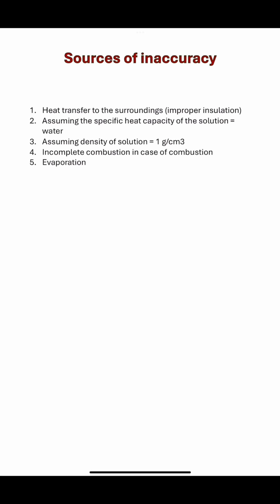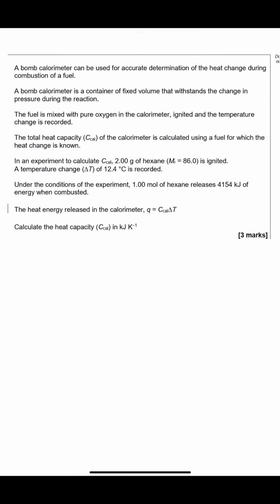Assuming that the density of the solution is the same as water, 1 gram per centimeter cubed, which is not the case. Incomplete combustion in case of combustion, and evaporation as well. So the fuel could evaporate, and also water that is heated or used in the system could evaporate. So what type of question would you expect in your exam?